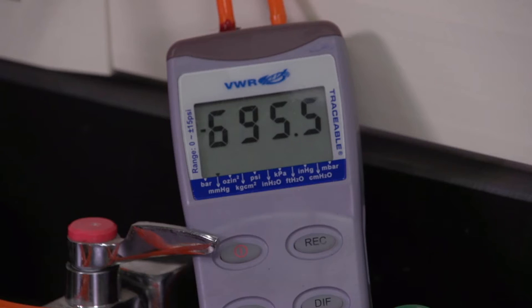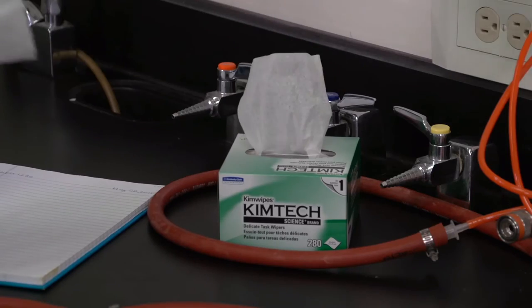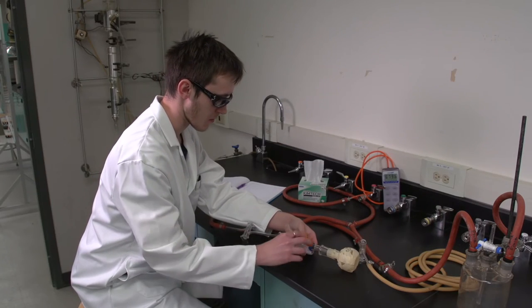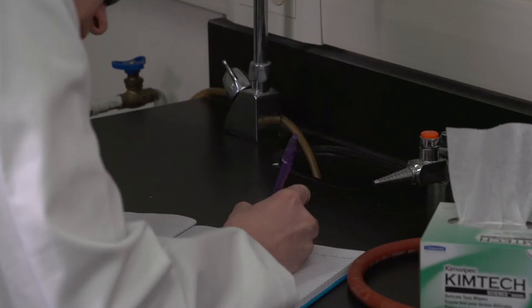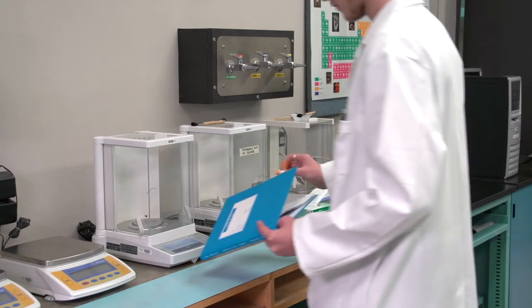Note the manometer reading and immediately close the 2 stopcocks that lead to the sample bottle. Write down the pressure reading. Remove the closed sample bottle from the system and determine its mass on the balance.